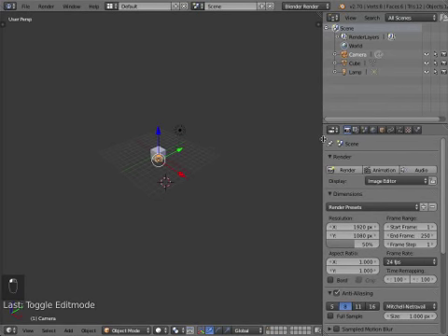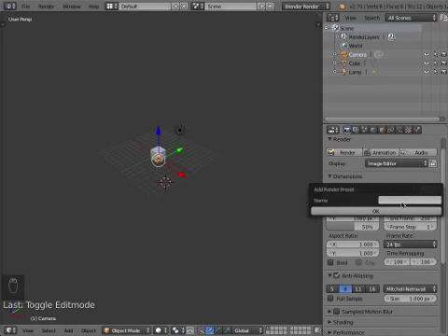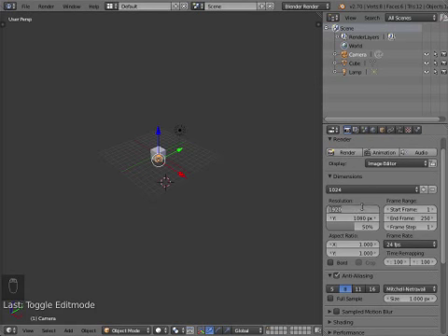In terms of the tabs, so what do we have here? The first one is the scene tab or the render tab, where we can either render just one frame or we can render the entire animation. Again, we'll come back to animation later. Resolution presets, you can come up with your own render presets. The one I'm usually using is, I call it 1024. It's 1024 by 1024, so it's a square format.